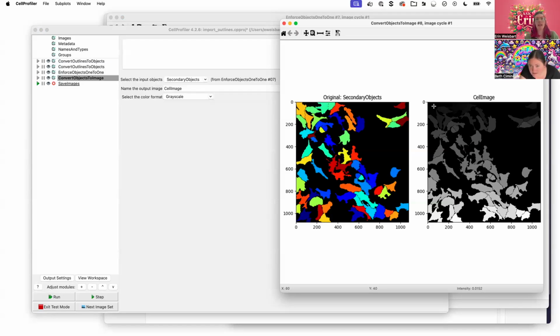Importing objects, right? Yeah. So the number of cells are scaled across the gray tones, 0 to 255. That makes sense. So again, this would be one that might be helpful for visualizations, but not as helpful for exportable data that you can then import easily.